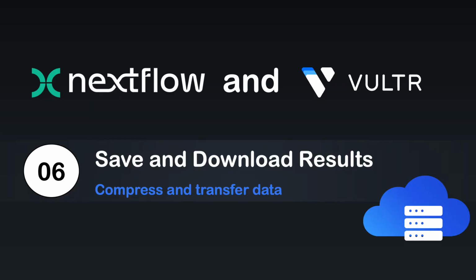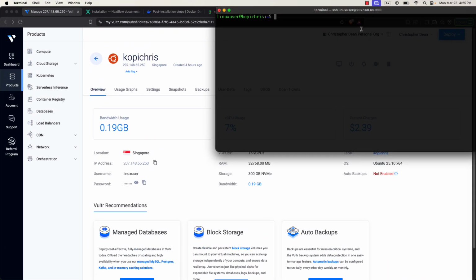Hey everyone, welcome back. In this video, we're going to take the results from our NF-core rnaseq pipeline on Vultr and transfer them back to our personal computer. Let's get started. We ran the NF-core rnaseq pipeline in a screen session, so let's reconnect to that and check on our results.